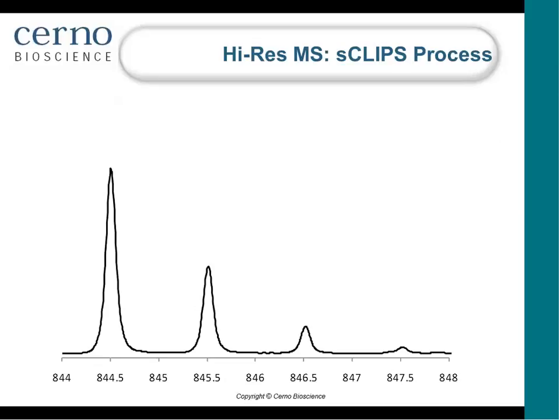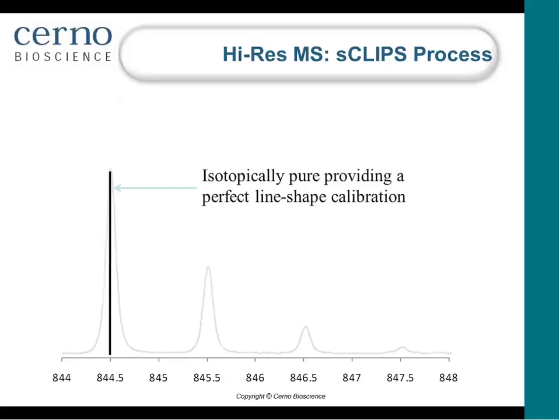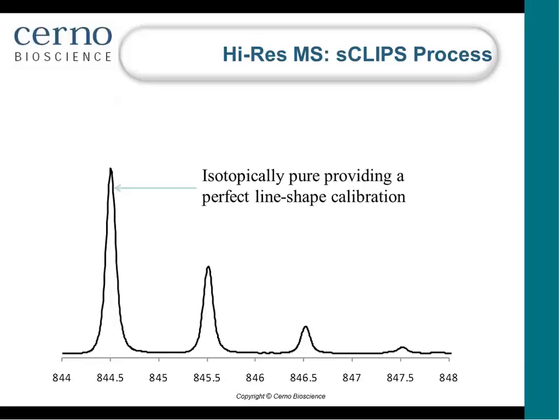So here's how it works. We use the monoisotope peak of the unknown itself to perform a peak shape only calibration. We do not perform mass calibration anymore. That's why we don't need any standards. And we rely on the fact that the monoisotope peak of the unknown is pretty well measured, and it's a very good representation of what the mass spectral peak shape function is at such mass and at such time.